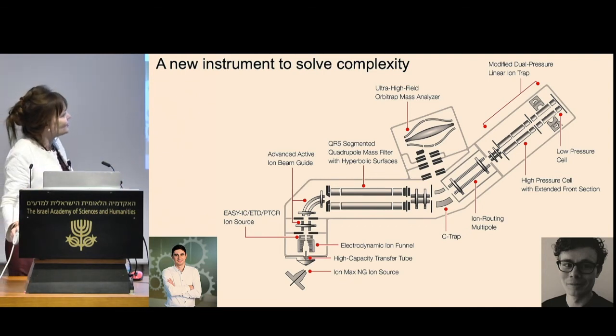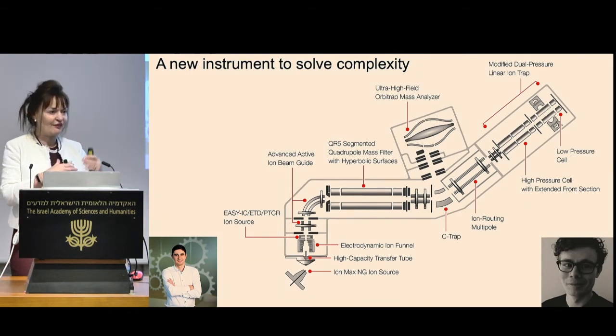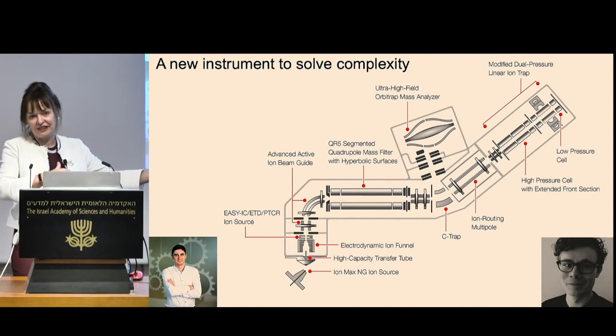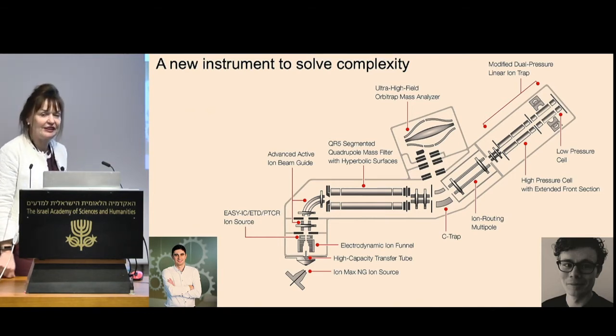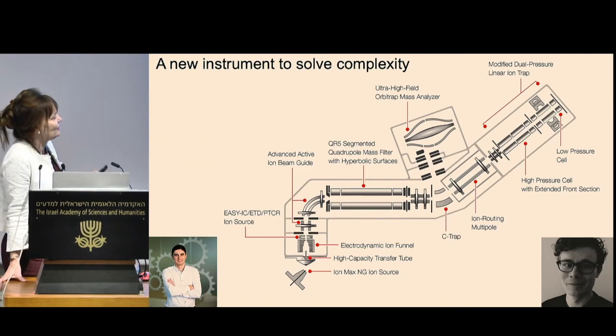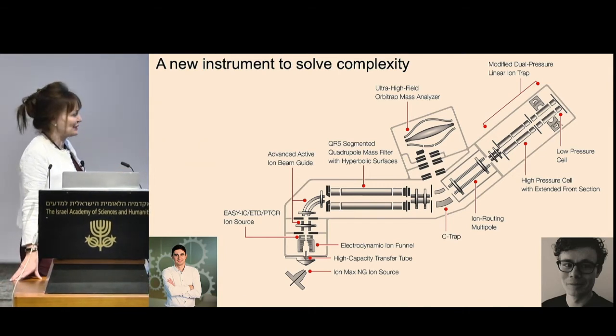So we now need to introduce yet more stages of mass spectrometry. So you have your protein going in from the membrane, then you select it, then you break it, then you select the bits that came off, and then you break those until you can go down to the very smallest molecule. And this is the work that Idi and Joe have been working on for nearly 3 years, I guess. It's taken a long time to get this working, and it's on a commercial instrument, but it had to be heavily modified. So this is, if you're interested, known as the Eclipse.